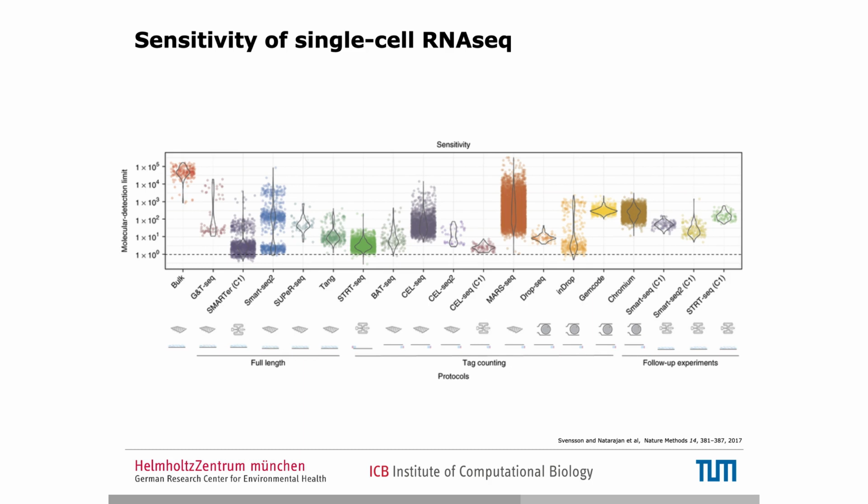So overall, you can't have it all. High sensitivity plus high throughput plus full length plus low noise level doesn't exist. So choose two, and then you already have the protocol that you should use. Most of the time, the shallow sequencing protocols give you all the information you can possibly detect from your data, and they tell you everything you ever wanted to know.